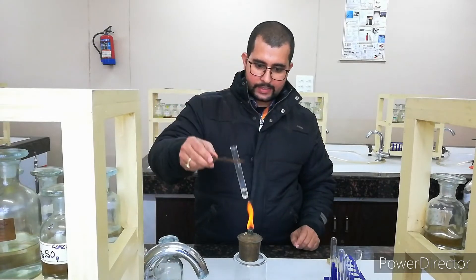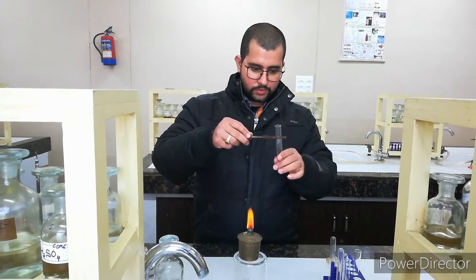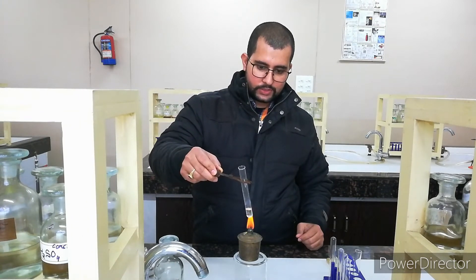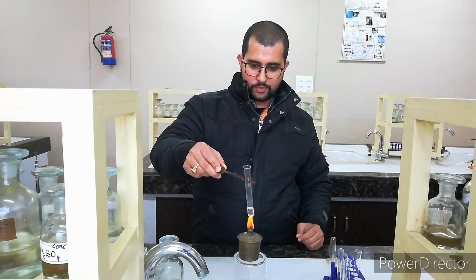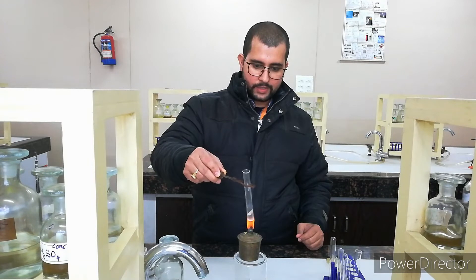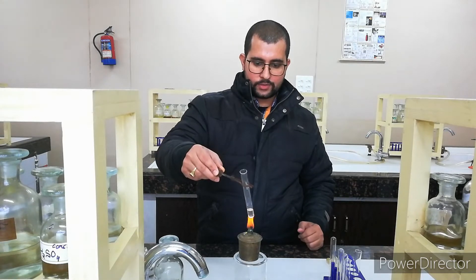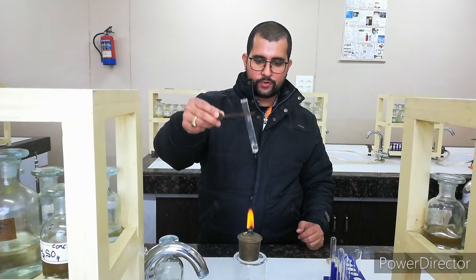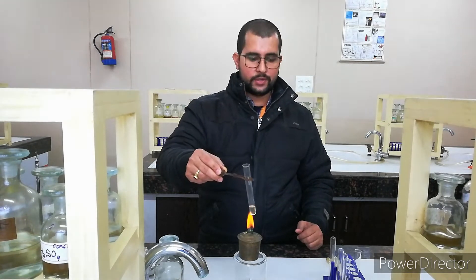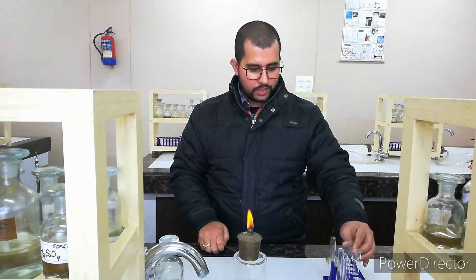Now we will heat it a little bit and observe if something happens. We will heat it gently, otherwise it will bump out, so we will be very careful. Nothing is happening by heating — it is near to boil and still no vapour is coming. So we can conclude with concentrated H₂SO₄: no observation is happening here. We will leave it and move for the next — the sulphate test.